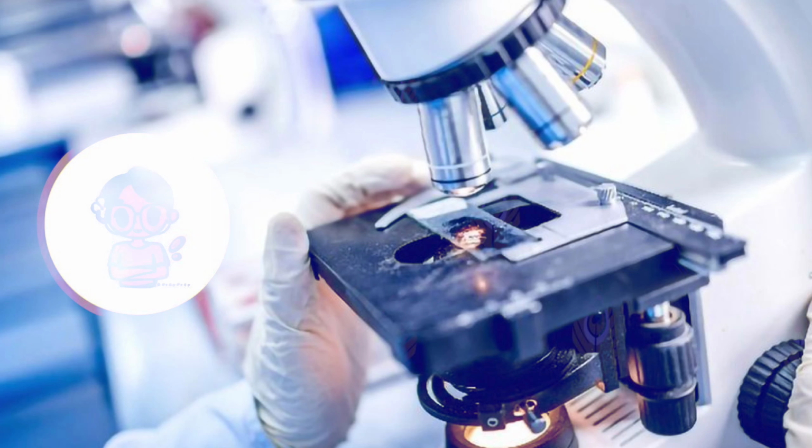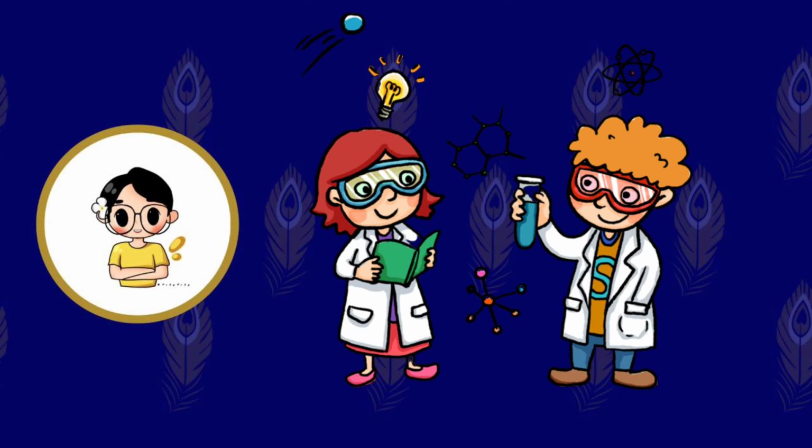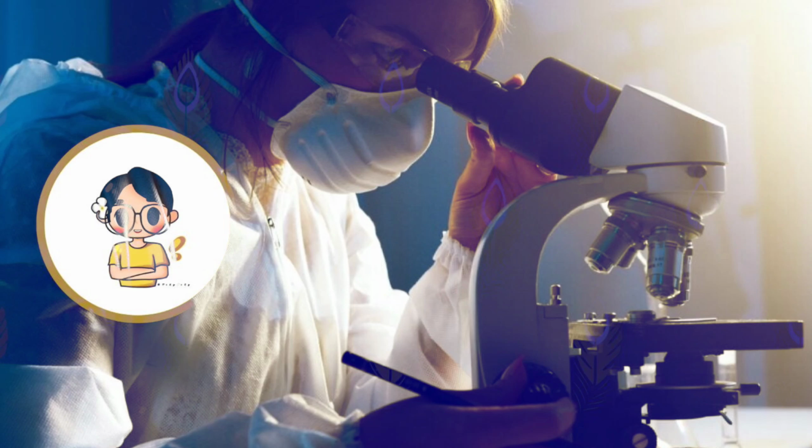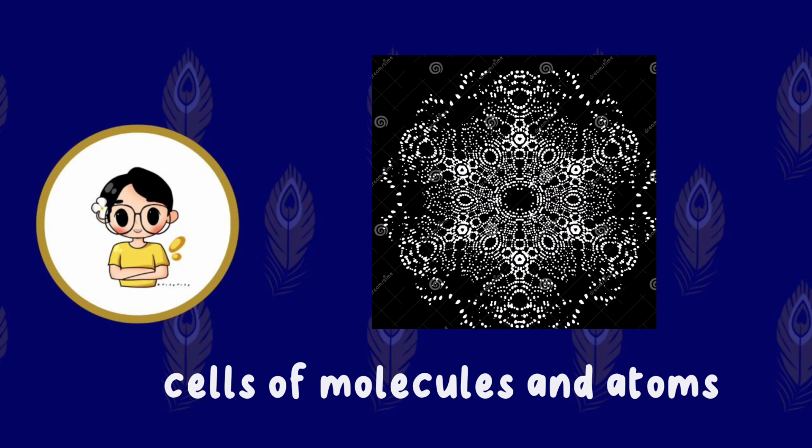The microscope was invented more than 400 years ago, and it's among the most useful of all scientific instruments. It has helped scientists to understand the building blocks of the world around us, from the cells of living things down to individual molecules and atoms, which are the tiny particles that everything is made of.